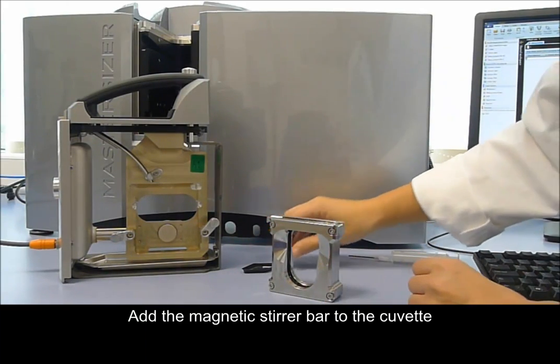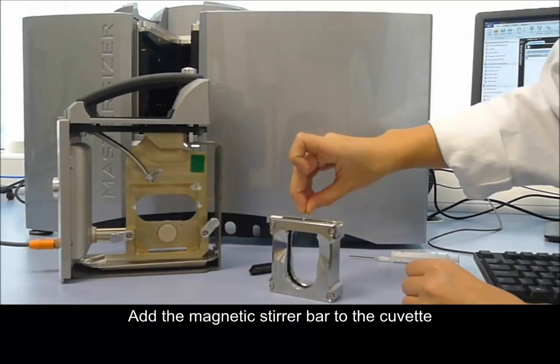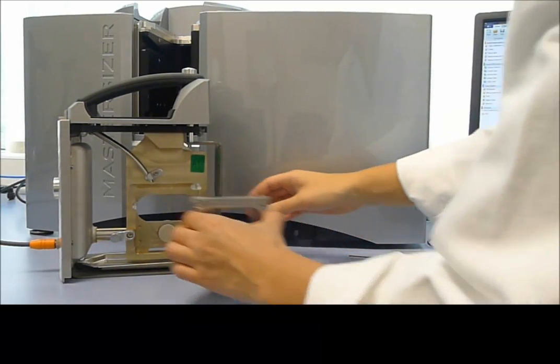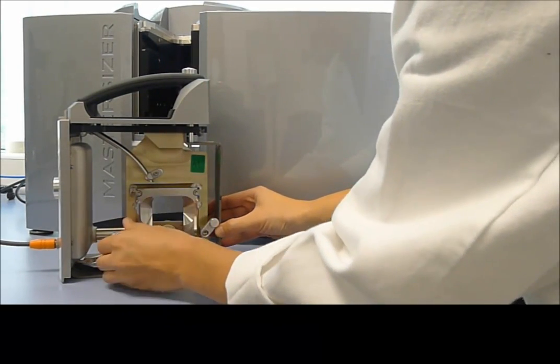Once we have added the dispersant, the next thing is to add the magnetic stirrer bar into the cuvette and then replace the cuvette into the cell holder and lock it into place.